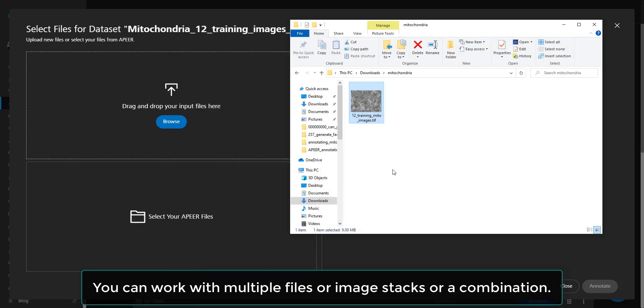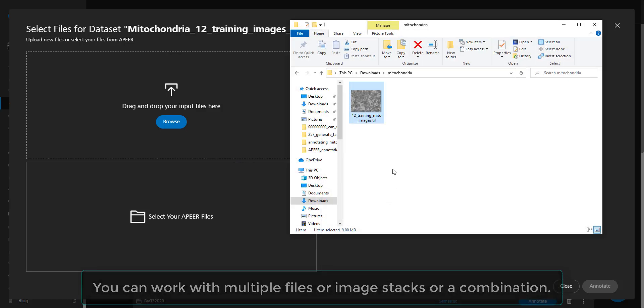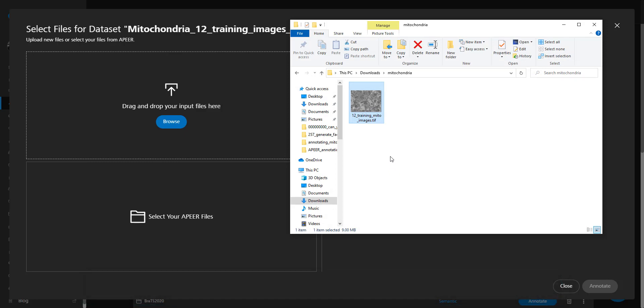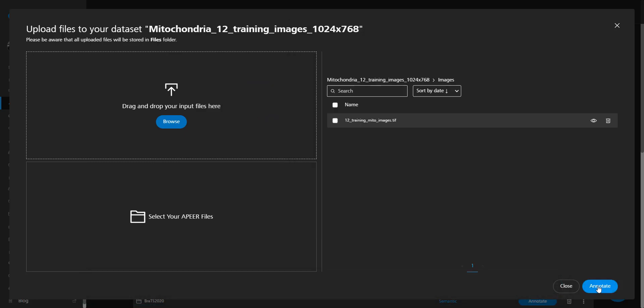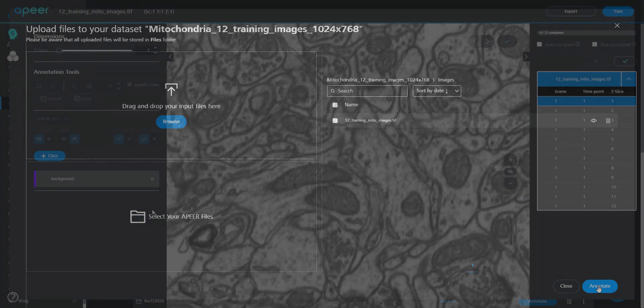Let's upload a TIFF stack of 12 images, each 1024 by 768 resolution. Click Annotate to get started with the annotation.